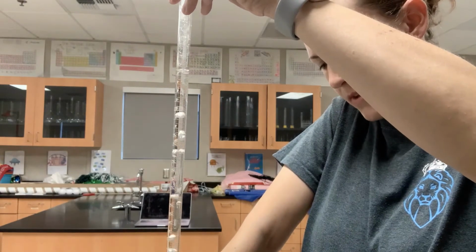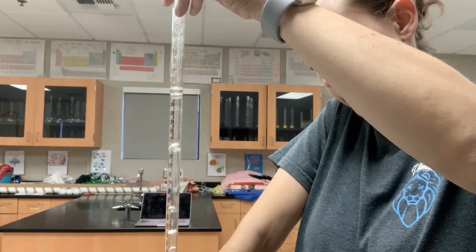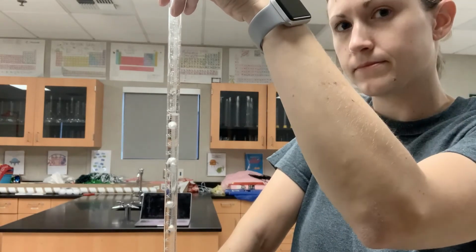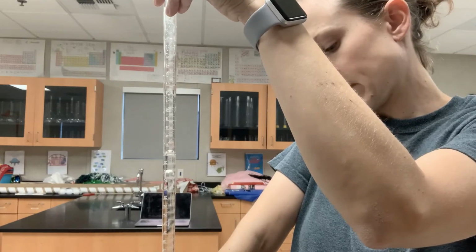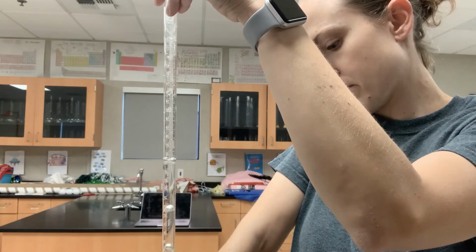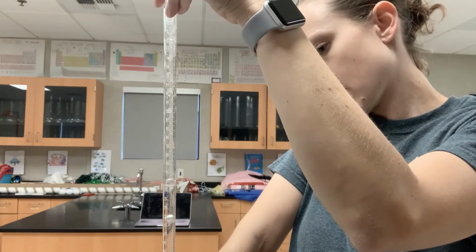Okay, and I'm going to go all the way down to displace 40 mils of water. So by displacing 40 mils of water, I am putting in 40 mils of gas.